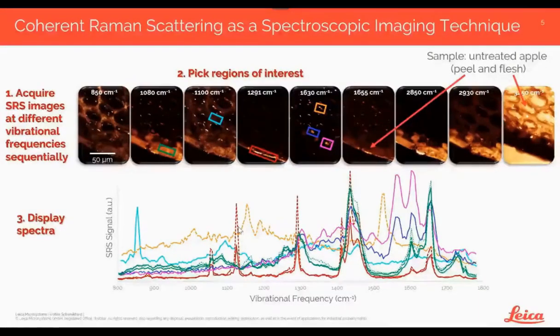Dr. Spicard, what objective has been used for imaging the zebrafish sample? So these, I believe, were 20x IR APO objectives. So these are water immersion objectives with a 20x magnification and numerical aperture of 0.7. But we have a range of different objectives available, ranging from a 10x magnification up to a 40x magnification that we can recommend for coherent Raman scattering microscopy.